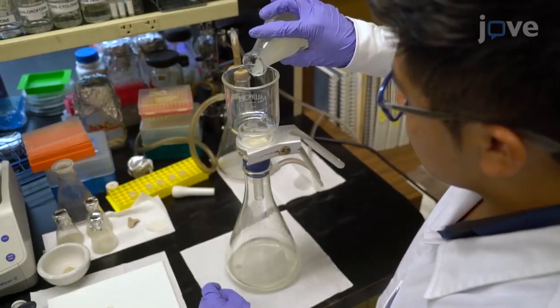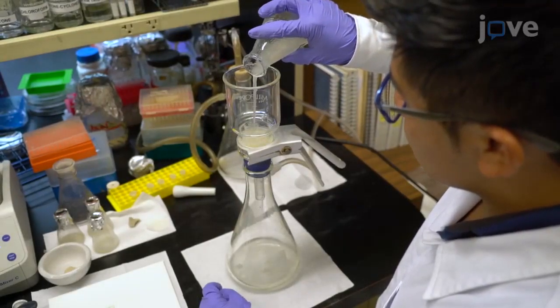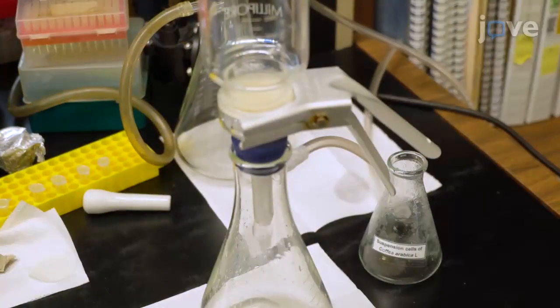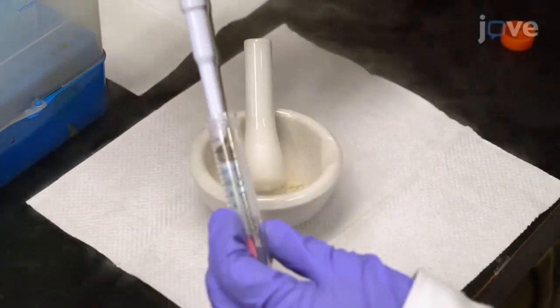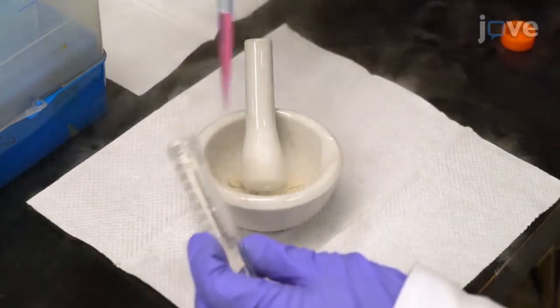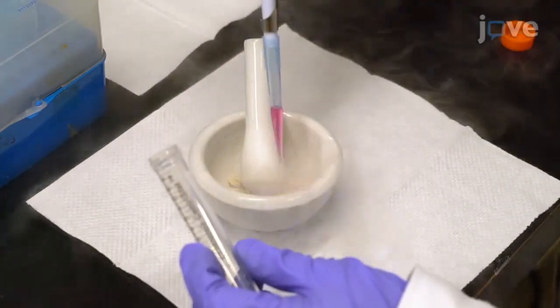Using filter paper, vacuum filter the previously prepared cell suspension. Then, use a porcelain mortar to macerate the cell sample with liquid nitrogen and RNA isolation reagent until it is homogenized.